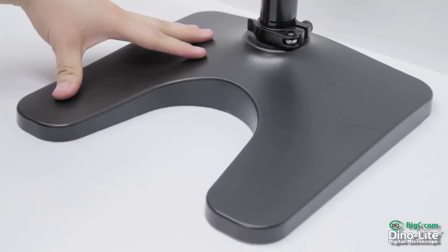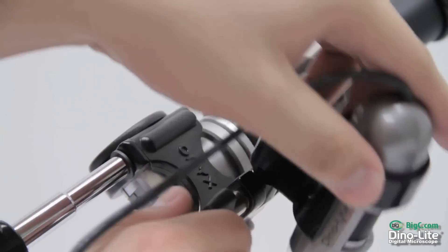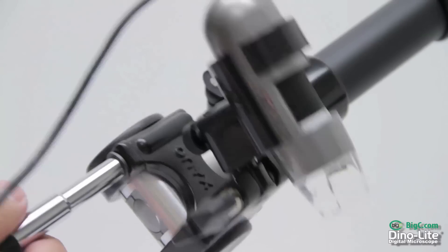It also comes with a tabletop mounting base and a multi-directional scope holder rotating 360 degrees plus a 180-degree pivot.